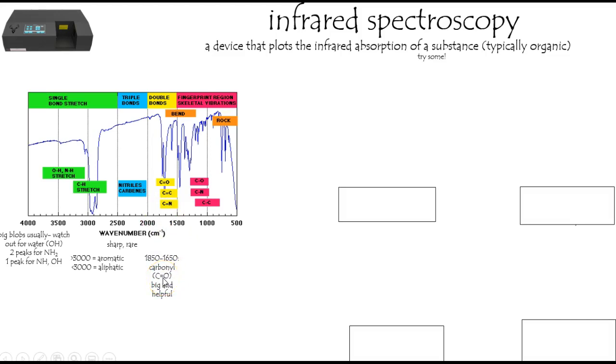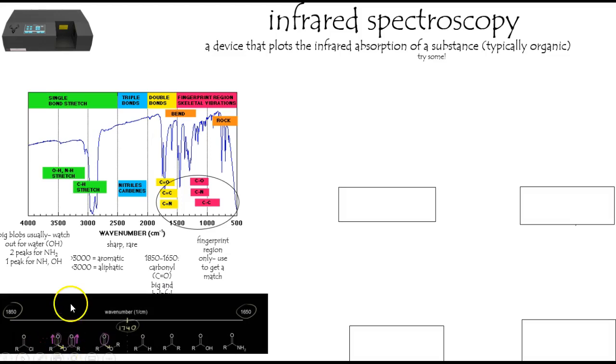Can you subdivide it? Yes, you can, and I really like this graph that I found that pretty cleanly shows you what the typical absorptions are. If you look these up in other tables, there's so much overlap it's hard to figure out. This can be a little misleading. Don't assume that this is exactly where they are, but it's a good place to start. I also love that whoever came up with this focused on the number 1740 as a central region, with some to the left of it and others to the right.